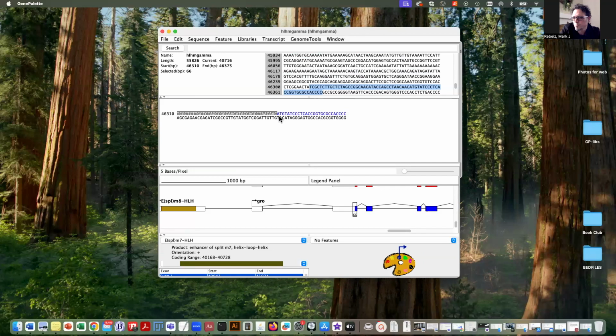And you can see the first three letters that are coded here are the first three nucleotides of the coding sequence. And the untranslated regions are shown in gray with white text. Now the sequences in the markup view are clickable so that I can go in and begin to figure things out and see where I am in the markup view.